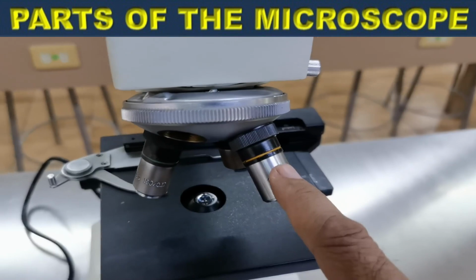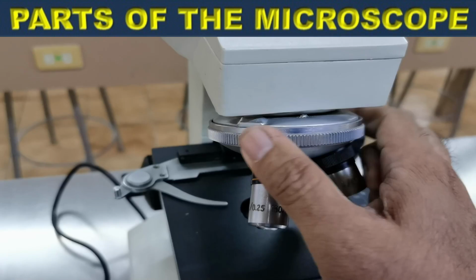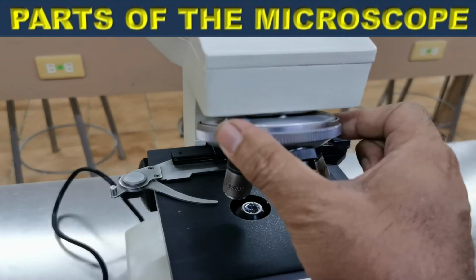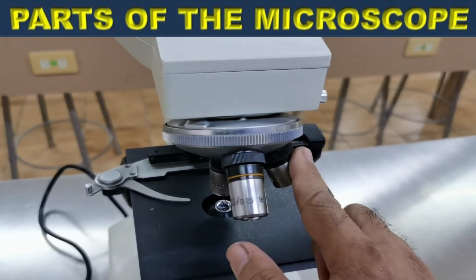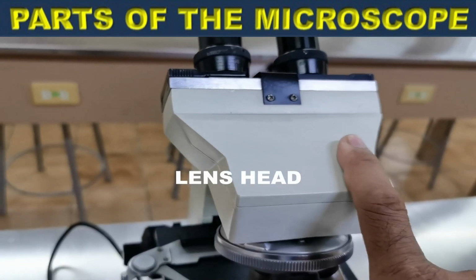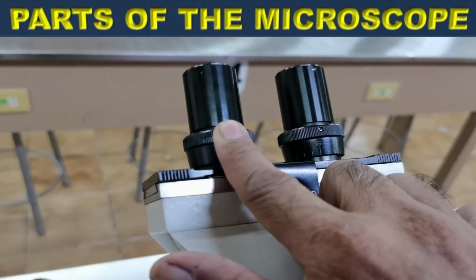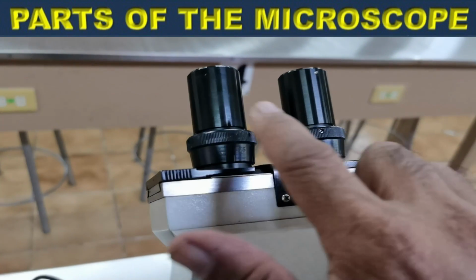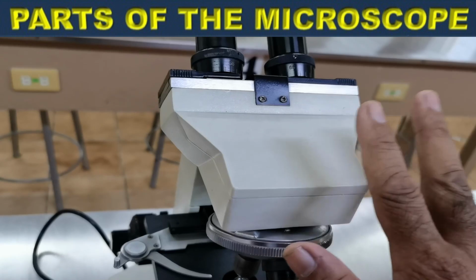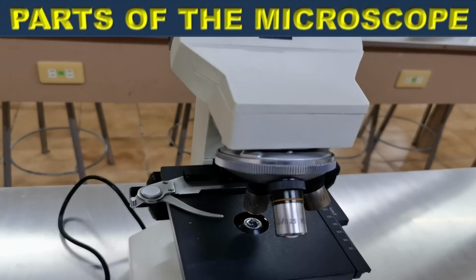So the revolving nose piece holds the objective lenses, and you can rotate it, as the name implies, so that you can shift objective lenses. Then here we have prisms that direct the light onto the ocular lens or the eyepiece. We have two eyepieces or two ocular lenses. This component houses the prisms that will split the light towards the two ocular lenses.